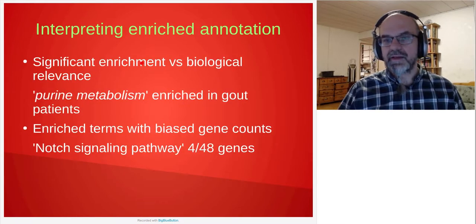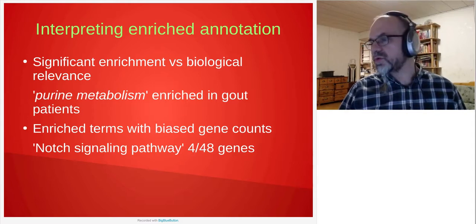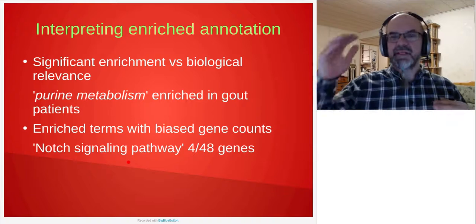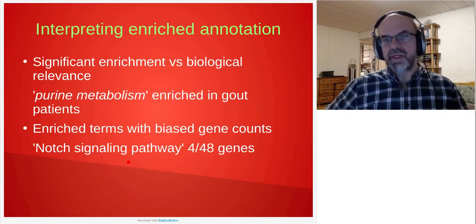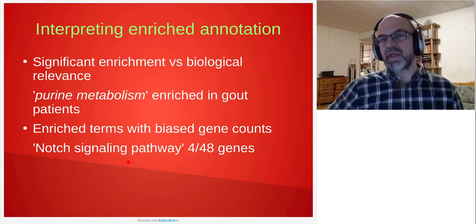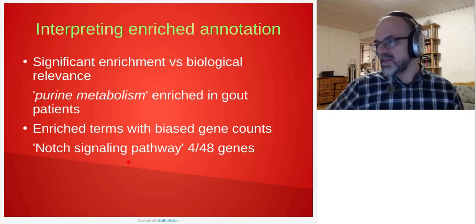Okay, at the end of this exercise, it doesn't matter if you have used overrepresentation analysis or enrichment analysis. You will have a list of annotation terms which are associated to your gene list. It is very important not just to mechanically accept the results of this kind of analysis.